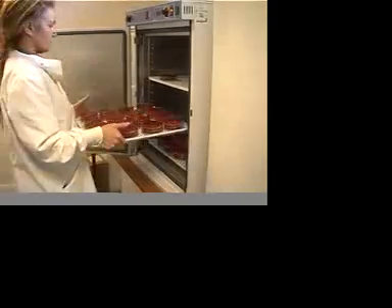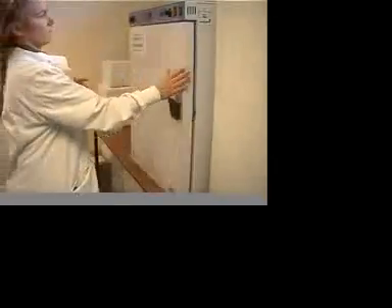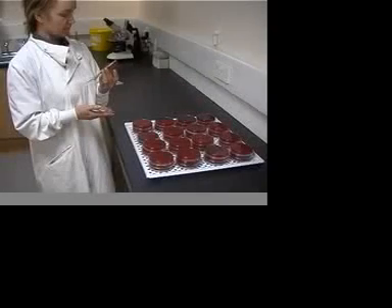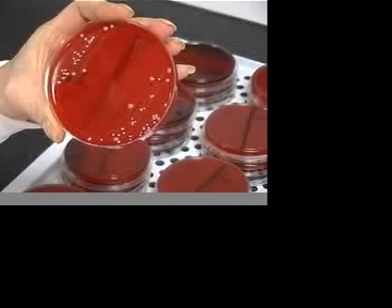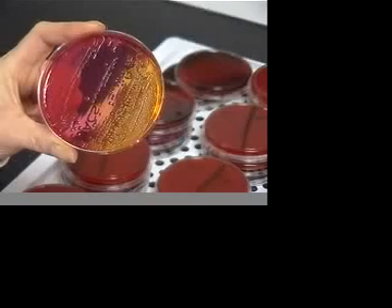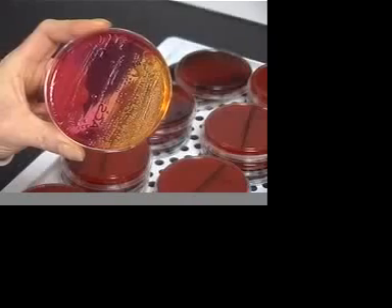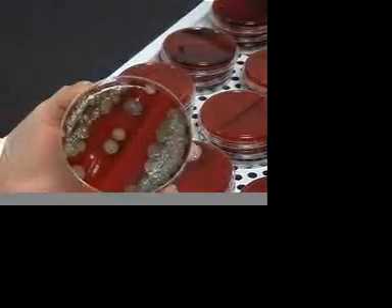The plates are incubated overnight at 37 degrees centigrade. The following day, they are inspected for bacterial growth. This is a Staph aureus plate — the yellow spots are individual colonies which have grown on the plate. This is an E. coli. This is a contaminated milk sample with lots of different bacteria and is useless for analysis.